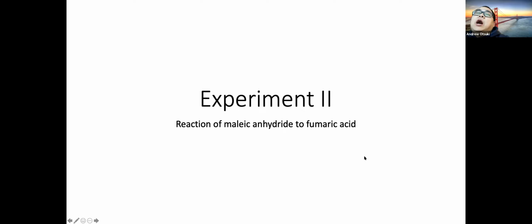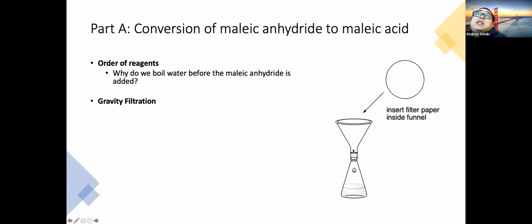So in gravity filtration, you care about the filtrate or the liquid. You usually do not care about the solid that you separated from the solution, if there's any. So we're going to use gravity filtration. Want filtrate, remove solid particulates.